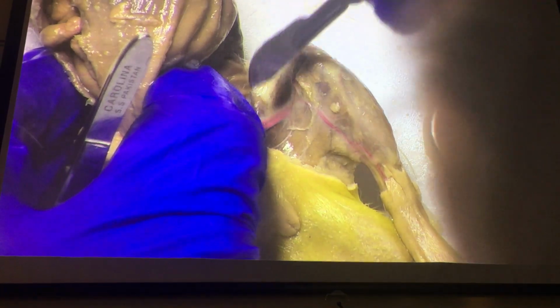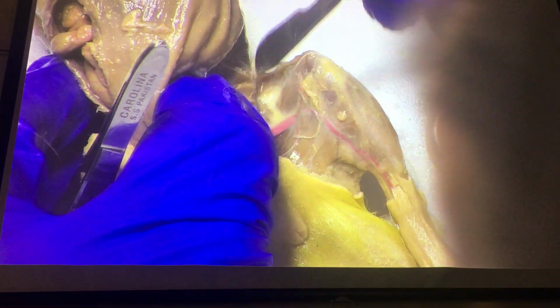There's our blood vessels. You can see a little blue vein right below the two arteries, which really should be one artery. It looks like it broke, which sometimes happens. More likely to happen with veins and arteries, as we'll see when we get into circulatory stuff later. So here we can begin to see these muscles a little bit. You don't want to pull too hard.